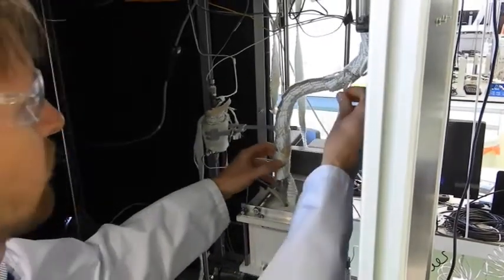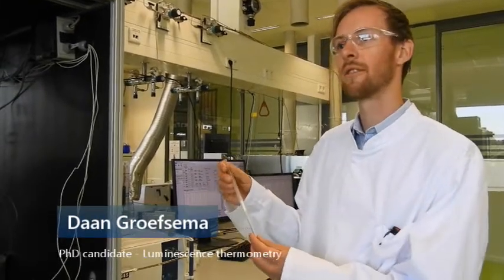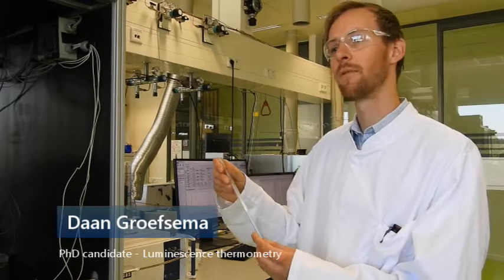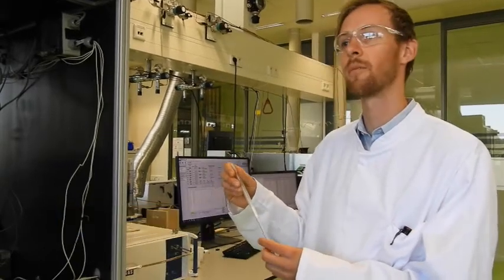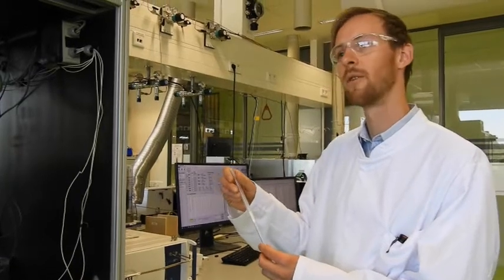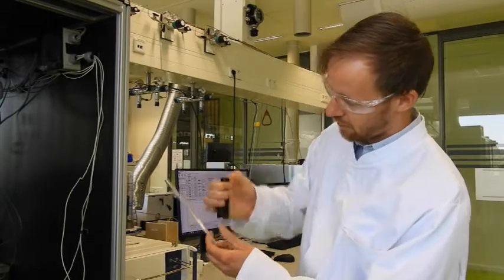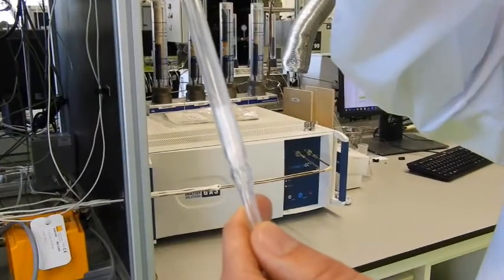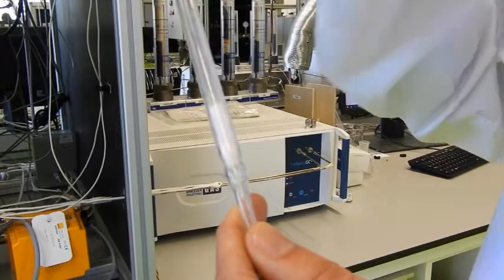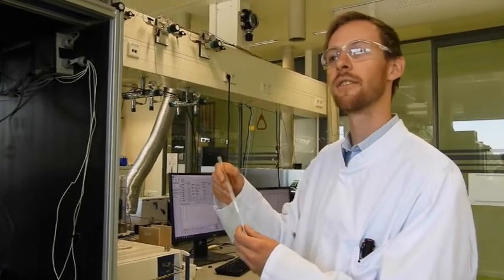So these kind of reactor tubes are the ones that we use in this setup to do our testing. But of course the average reactor temperature can vary quite a bit from what's going on inside of this tube. So that's where luminescence thermometry comes in. If we include a luminescent ion in the material, here I can show it to you. If we excite this with a UV light, you see some very nice red luminescence. We can actually use that to measure the temperature locally on the surface of the actual catalyst.